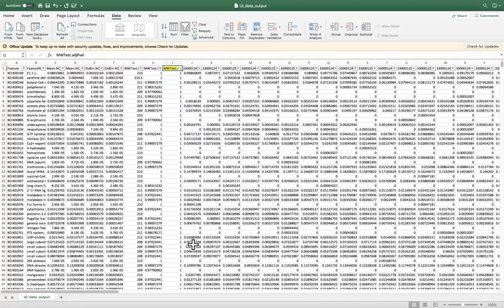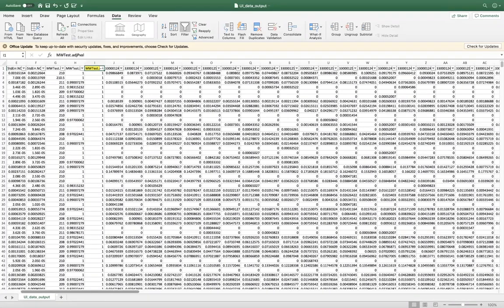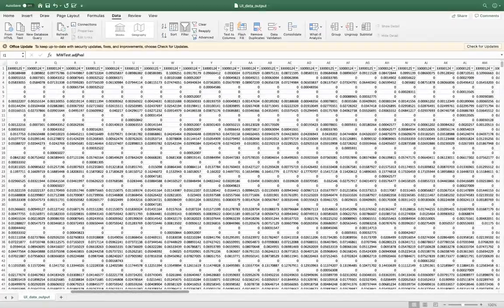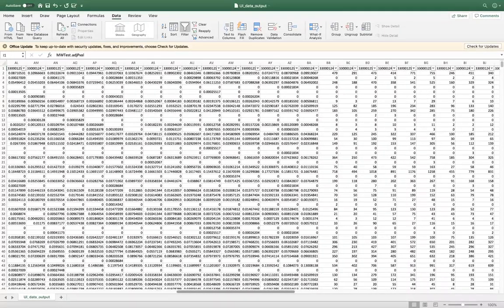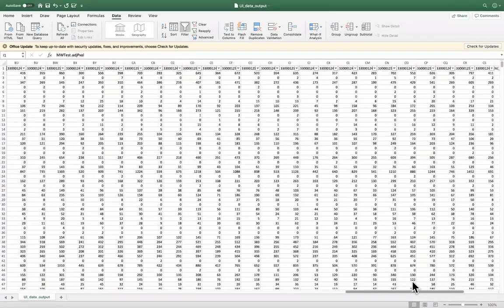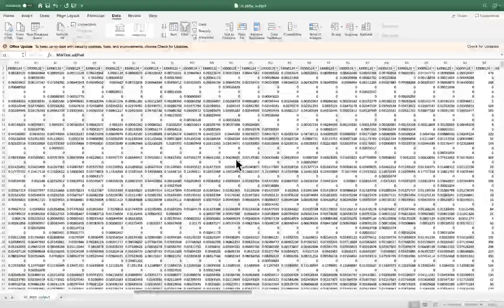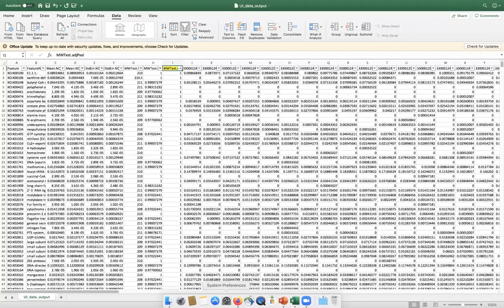And then the other thing I want to point out to you is that you have the normalized counts of every single sample in every group. So for my 30 plus 14, 44 different samples, I have the normalized counts of the genes. And followed by those 44, I have the raw gene counts as well in this table. So this is a really good resource, especially if you want to check out other statistical methodologies or other ways of normalizing. This is also a resource that's available.